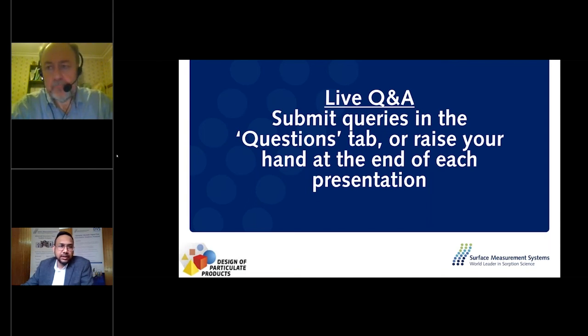There is one question that I received really in the beginning. I think that was for Professor Hartmann, and it is about whether fluorines of different size will create different signals due to the difference in surface area or volume. Can you just repeat that once more, please, Ramiz? Will fluorines of different sizes create different signals due to the difference in surface or volume? I think this is about NMR that Professor Hartmann presented. If it's an NMR question, I'm not the person to help.